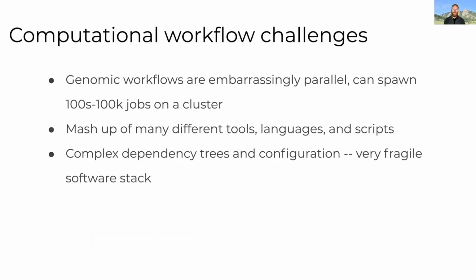So let's talk about some of the challenges that arise, in particular in computational biology, in trying to develop reproducible workflows. One is that these workflows can be quite large, and they're also embarrassingly parallel, which means that maybe each FASTQ or each experiment can be run separately for most of the computations that need to be done on that data, and that there can be hundreds or sometimes hundreds of thousands of samples that you're analyzing.